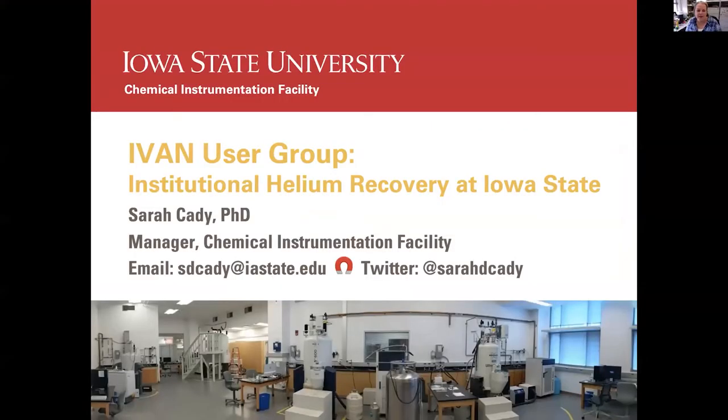Okay, hello everyone, and thank you for coming today. We're pretty lucky here at Iowa State. We have an institutional helium recovery in the Ames Lab low temperature lab, but I'm going to talk about how we tie into that and some of the problems we've run into over the years. My email and my Twitter are there if you need to contact me for additional questions later on.